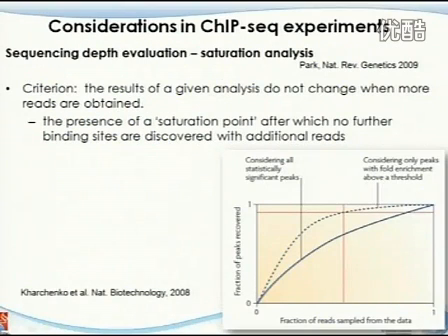And the next thing you want to consider is the so-called sequencing depth evaluation, meaning that we know these machines are really, really powerful. You can sequence 1 million reads for one sample, 10 million or 100 million, as many as you want. But how many reads do you really need for one sample? This is not an easy question to answer, actually. It's condition specific, it's protein specific.